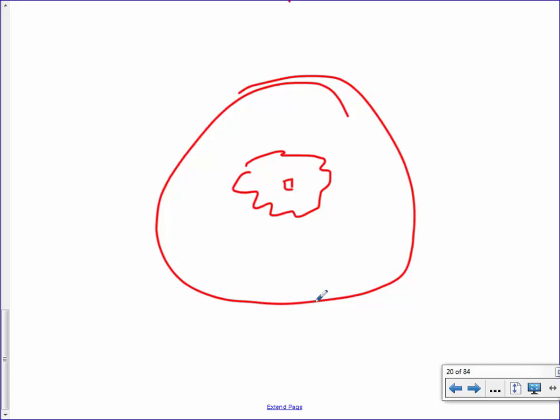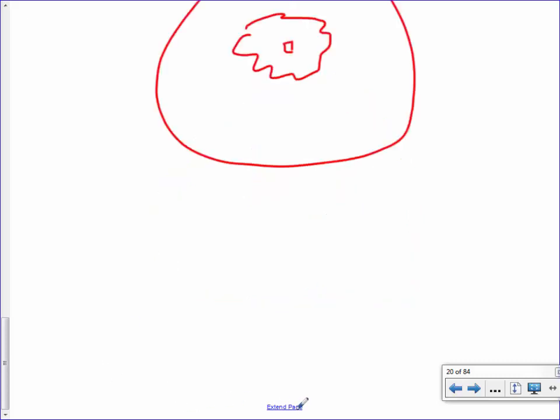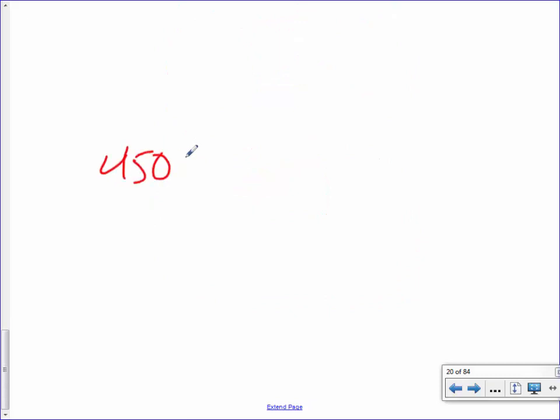Now, I'm not really a big fan of how they do these calculations because they have a formula there, but I think the best thing to work on would be this line of work they have right here. Normally, it's 4,500 micrometers. But what's going to happen is that was done under 4 times zoom, and now it's going to be done under, say, 40 times zoom. What happens if you multiply by 4 and divide by 40? What's going to happen to your number? Good. The reason it's going to go smaller is because what you used to be able to see is now zoomed in smaller.